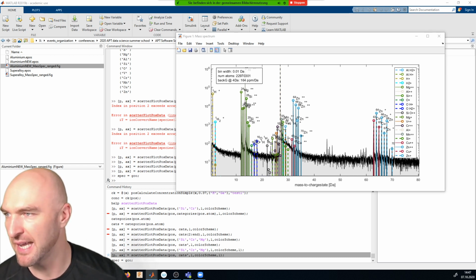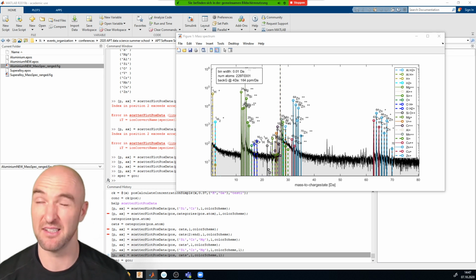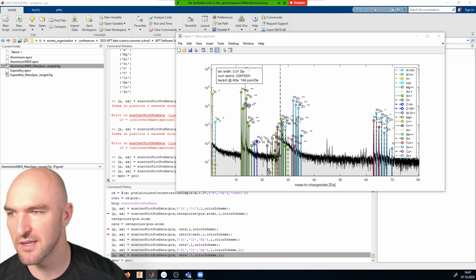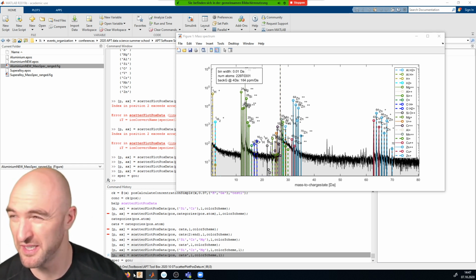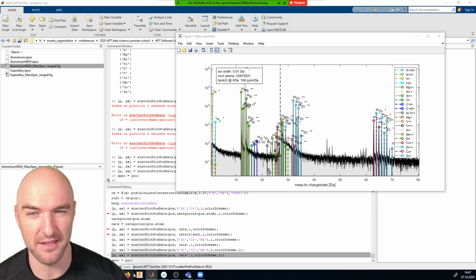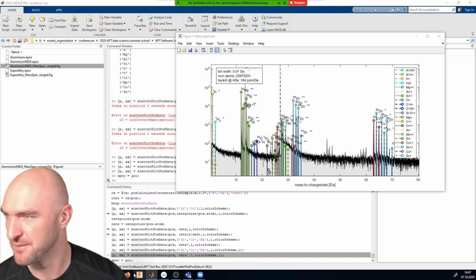The tiled layout was only introduced last year or the year before. Okay, 2018 should definitely be there. There's a couple of things: the live scripts, I think, were introduced in 2017 or something, and the tiled layout sometime last year or so.